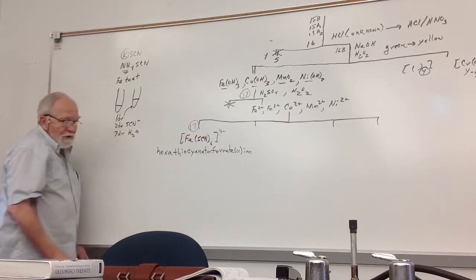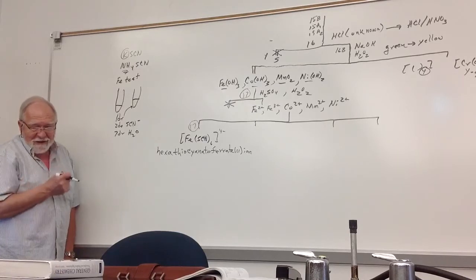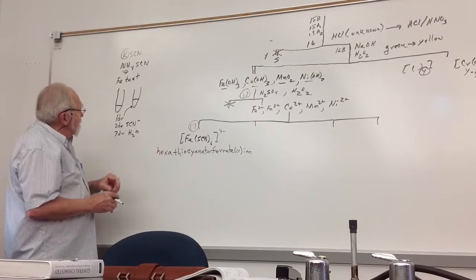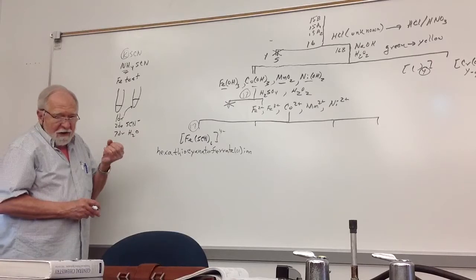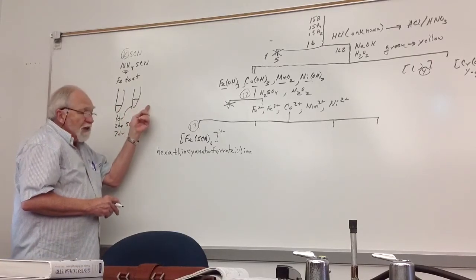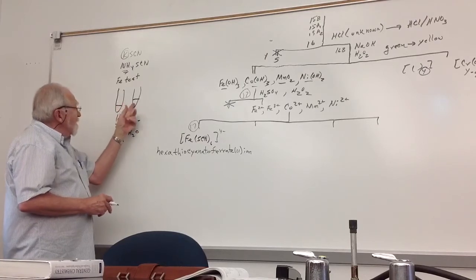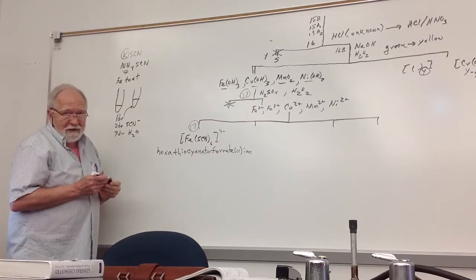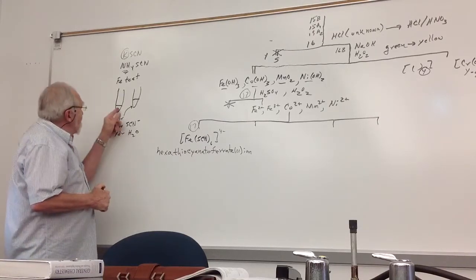So I'm going to see both those test tubes, so I can tell you whether I think it looks like a trace color when you do it. Because the major problem with iron, if you don't clean your test tubes thoroughly, and almost everybody gets some iron contamination, but it's a very light red-brown. This you can't see through. This you can see through somewhat. Okay? So I can comment about it when I see it, say whether you got enough here or not.